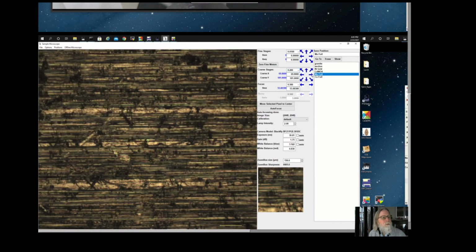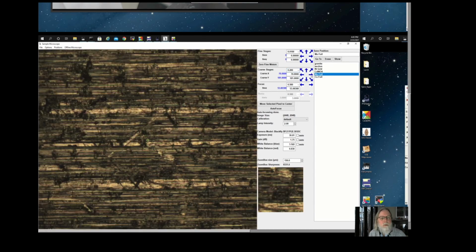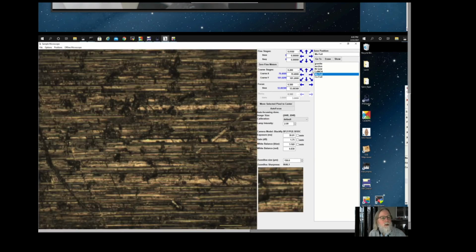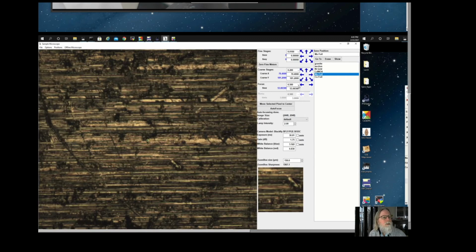Again, we have the controls for the sample stages themselves, with changing the step size. These are all in millimeter steps. You can change to much bigger steps, and then you can drive the sample right and left. I'll make it smaller. Right and left. Move the sample to the left. Move the sample to the right. Move the sample to the right again. Move the sample up and to the right, and then focus the beam.